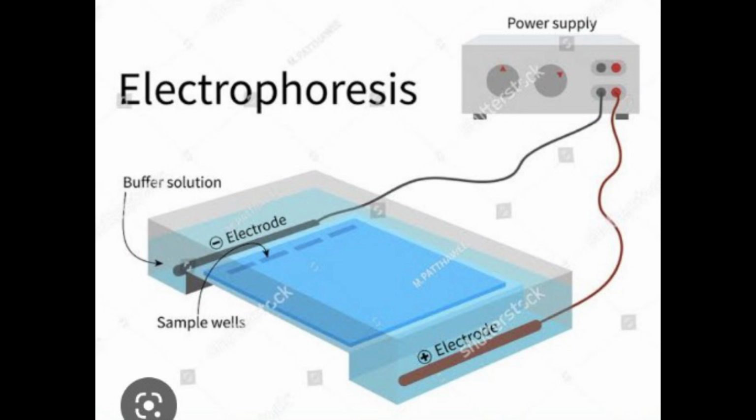Application. Electrophoresis is useful in the separation of serum proteins for diagnostic purposes, hemoglobin separation, lipoprotein separation and identification, isoenzyme separation and analysis, nucleic acid studies, and determination of molecular weight of proteins. Serum protein separation by agarose gel electrophoresis.